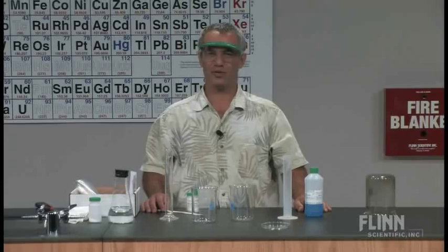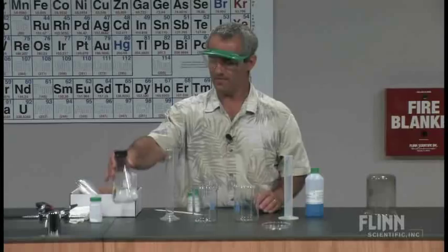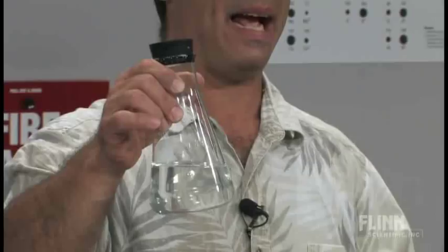A really good demonstration to do when you're discussing solutions with your students and the idea of saturated, unsaturated, supersaturated is the canned heat demonstration. What I've got here is a saturated solution of calcium acetate.